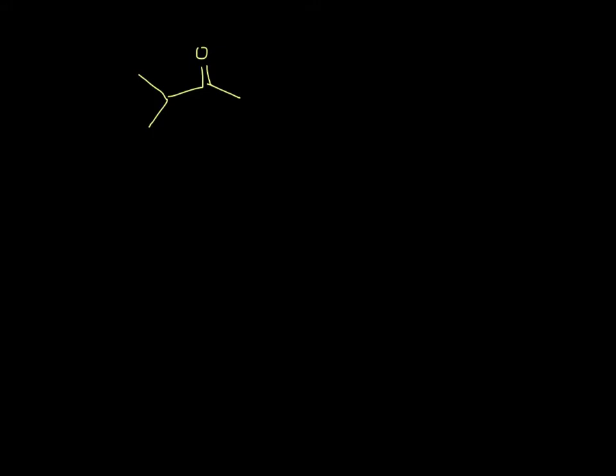Of course, in NMR what we're looking at is the hydrogens. Therefore, I would highly suggest you draw these out as Lewis structures. I know that it's boring, I know that it takes time, but it's really important to be able to see all of the hydrogens. So I'm going to do that right now. I would suggest that you all do the same for any molecule that you're looking at by NMR, just to make sure you get all of your hydrogens. Alright, that one's a little tiny hydrogen.